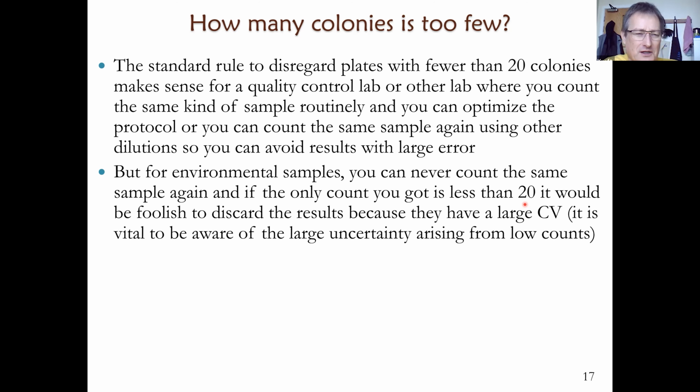And if you were to average plate counts from the same sample from different plates with different counts, you're basically giving both plates the same weight, although the plate with a larger count has a lower error than the plate with a lower number of colonies. So just taking averages between plates means you're not considering that the plates with a higher count have a lower error.